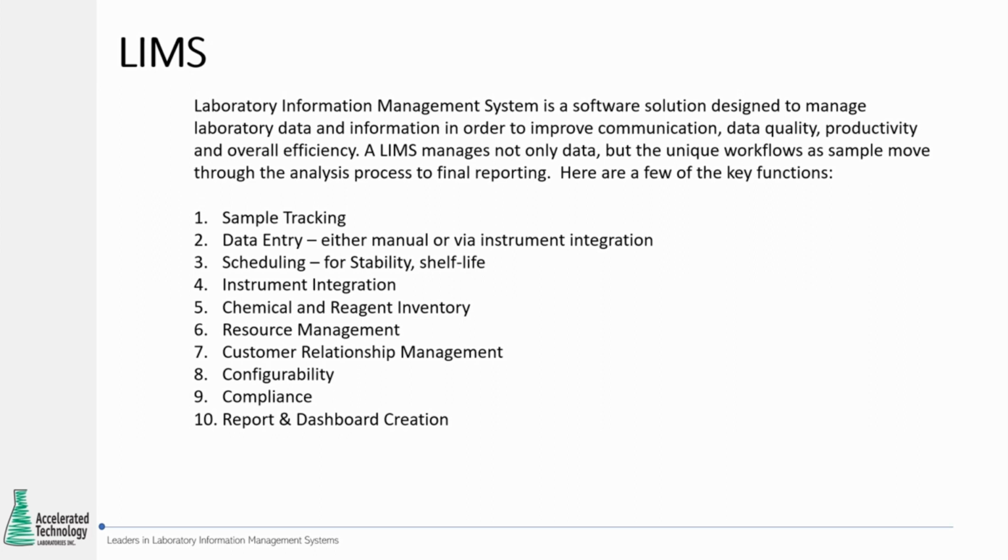Next, data entry, where results can be entered either manually or, in today's world, probably 90 to 95% of the results come from instrumentation, which is designed to be integratable with LIMS systems so that that data can be moved electronically, and you avoid transcription errors, because at the end of the day, a laboratory wants to make sure that they have high quality data that they're delivering to their customers.